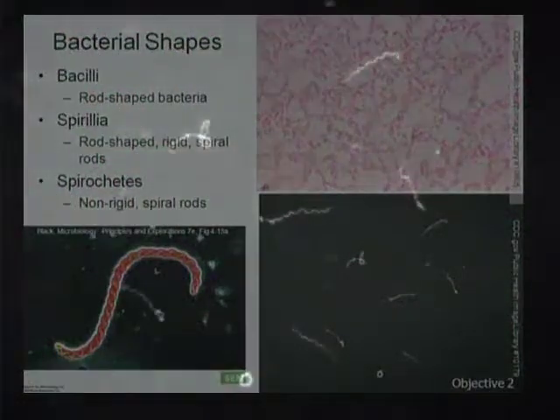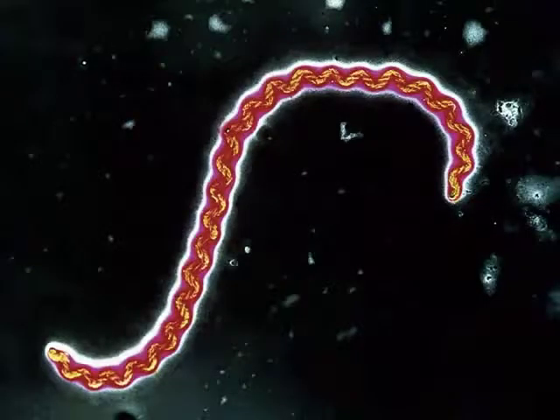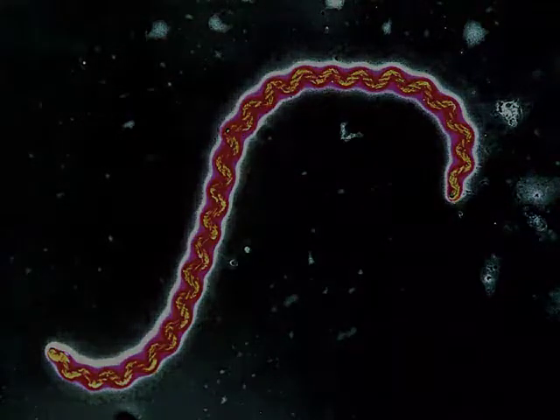Spirilla and spirochetes again. These are spirochetes on the bottom right. Dark field microscopy again. So cool looking. Spirochetes cause a disease called syphilis. You may have heard of that, among other things.